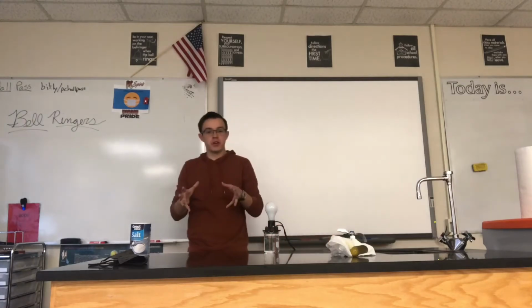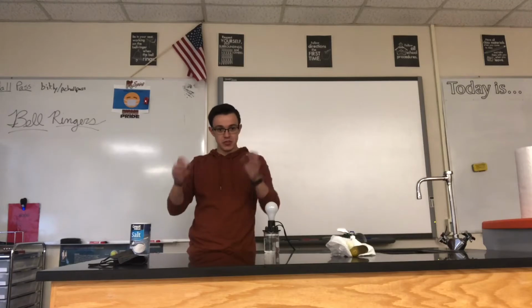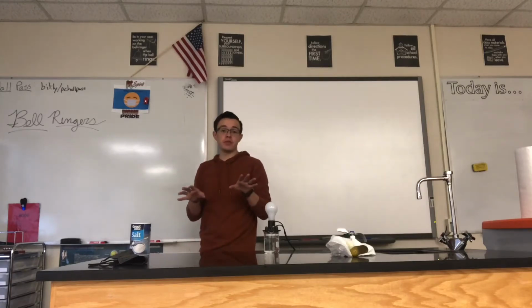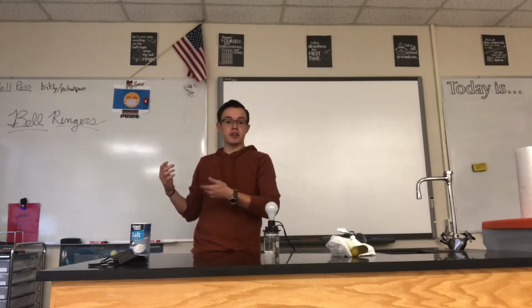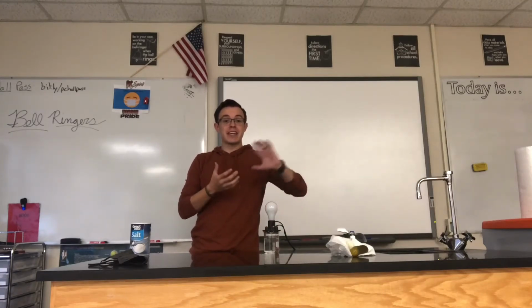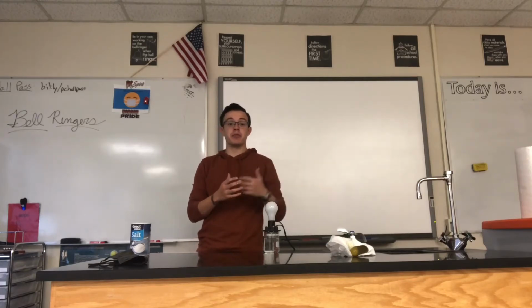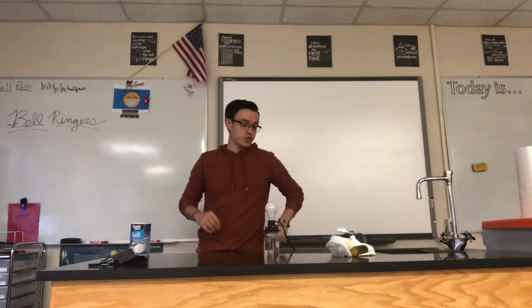So I'm recording my own demonstration video for you today to introduce the idea of ionic compounds. So far we've learned about ions, how metals will lose electrons to become like noble gases. When they lose electrons, they get a positive charge. We've talked about how non-metals will gain electrons to be like the next nearest noble gas on the periodic table. Because they gain electrons, they have a negative charge.